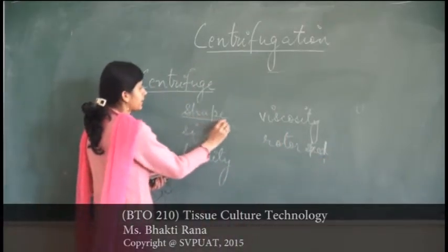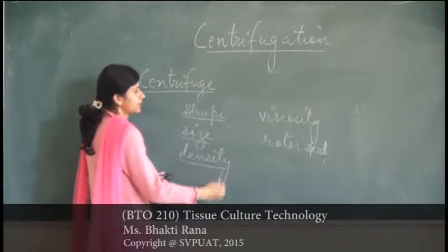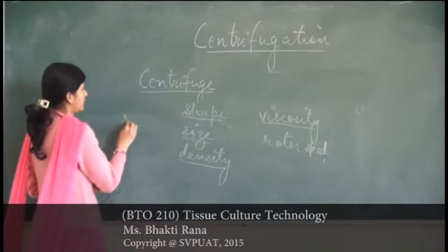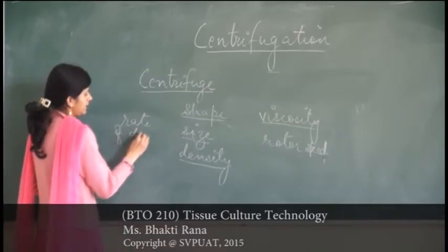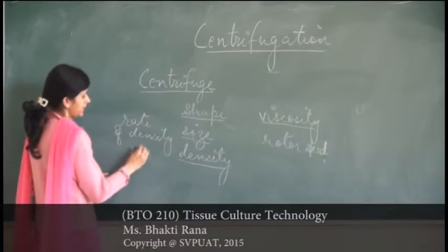How does it separate on the basis of shape? How does it separate on the basis of size? How does it separate on the basis of density? It depends upon the rate of density or rate of size.